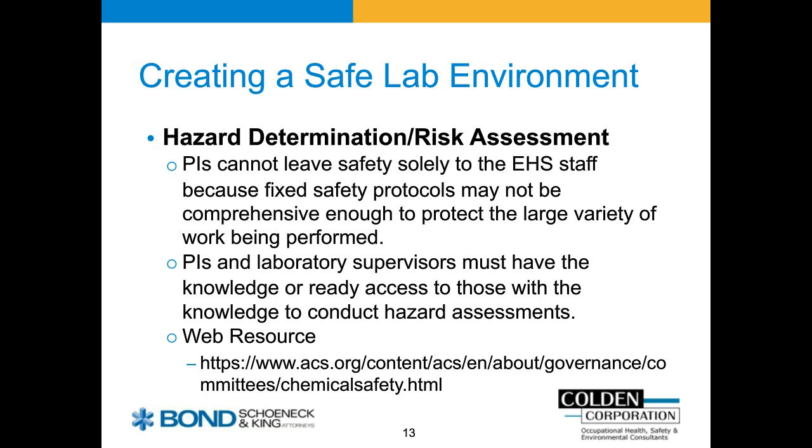Shannon, in some of these labs, are there other chemicals that you've seen come up in the teaching lab that are potentially problematic that people should be sensitive to? Sure. And I'm glad you said teaching lab, because we've been focused on the research labs. Health and safety professionals have an obligation to make sure we're doing nothing hazardous in the teaching labs. So I think we probably all could agree that in the teaching labs, we really should be taking every opportunity to eliminate or substitute hazards. In a teaching environment, there's a number of ways to demonstrate things.